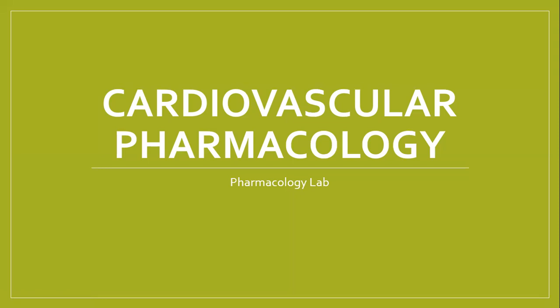Langendorff is not only associated with the frog heart, but with any other mammalian or non-mammalian heart that can be used to test the activity of drugs. It can be a rat heart, or a frog heart, which we can use for testing the activity of drugs.